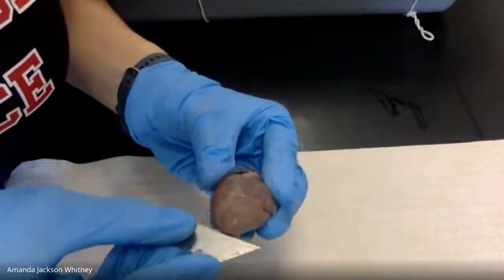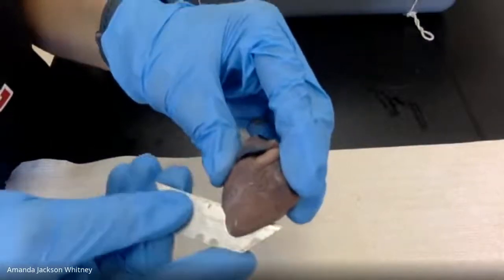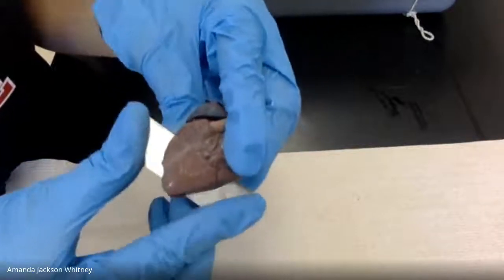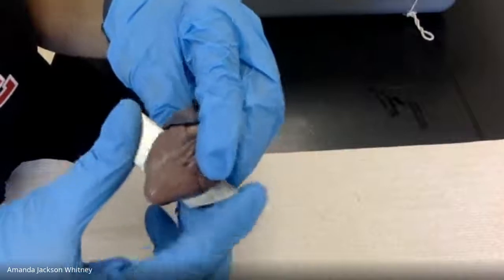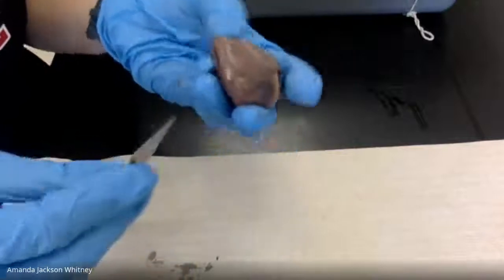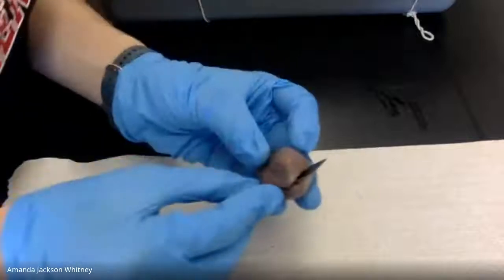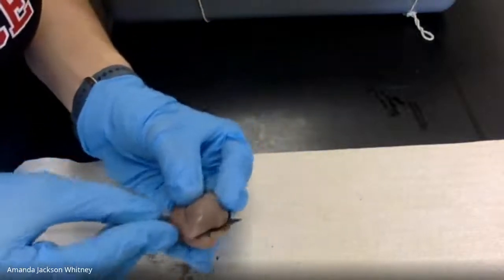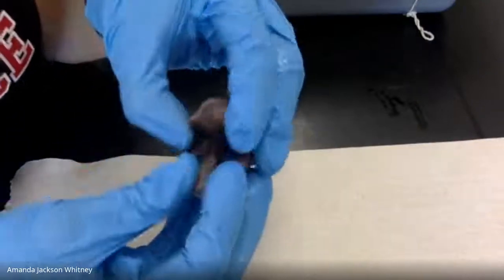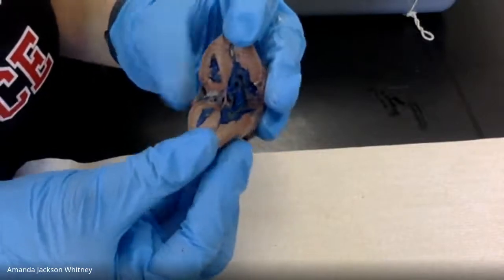Okay, I'm going to start cutting through here. I'm going to make a frontal or a coronal cut. Coronal is called a coronal cut because it makes it very easy for us to look at what's inside the heart. So that's kind of where it got its name from. Sorry, I know it's hard for you to see what I'm doing. But basically just opening it up like a fillet here, for lack of a better description.